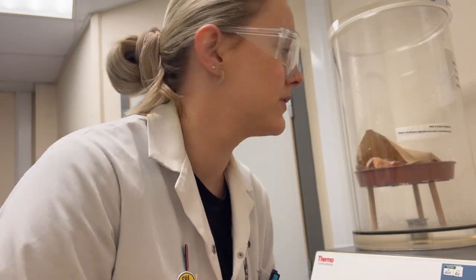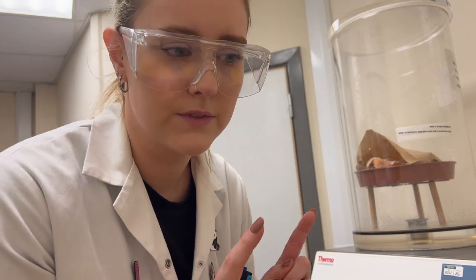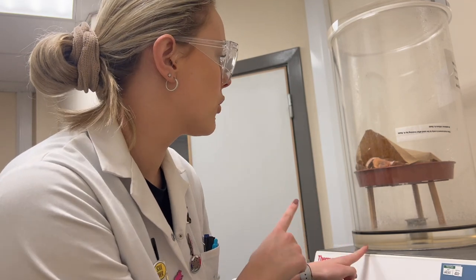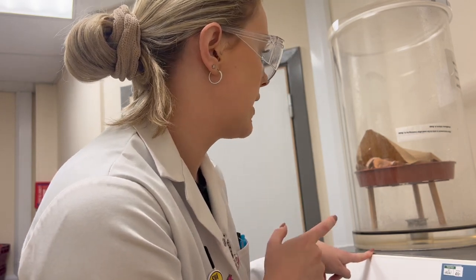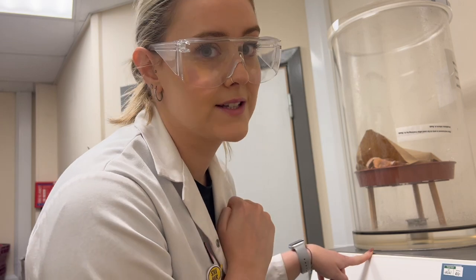Hello, good morning. I hope you can hear me. It's very loud in here, but if you remember from the vlog two weeks ago, I can't speak. I was freeze drying the coral, which has been freeze drying over the weekend because we're a week ahead now, and it looks dry, so I'm going to remove it from the freeze dryer and then we can start to extract it.